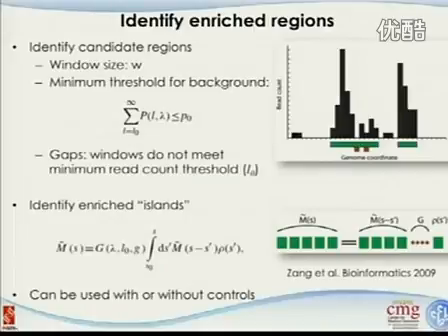So I just want to have a little bit of side notes on that. For this, as I mentioned several times, this is the only approach I was able to find. There is another publication using a hidden Markov model. It looks like they are targeting the same problem, but what they are trying to identify is the differences between two samples, differential chromatin states. And that will be different. But for our purpose, this is more equivalent to the peak binding part in the transcription factor binding sites, and this looks for the broader enriched regions in the histone markers.